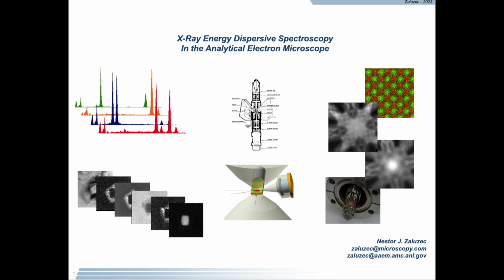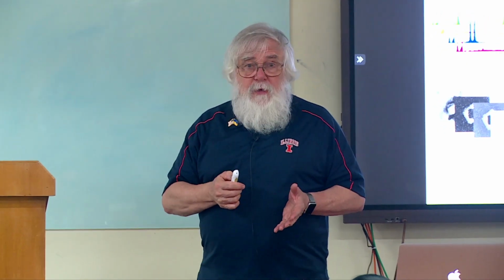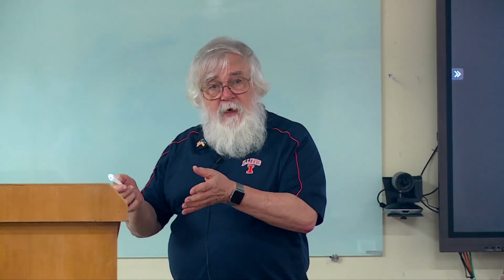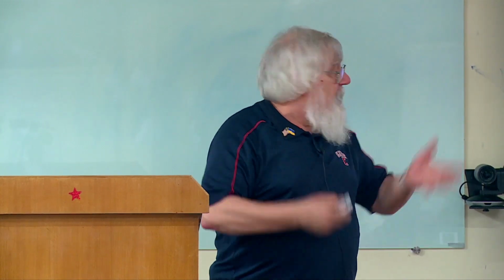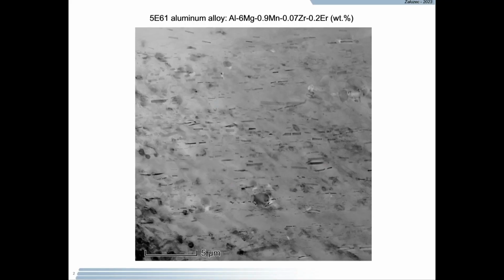So far, we've looked at the microscope as a tool for generating a beam, creating images, creating diffraction. That's a valuable bit of information. You saw some beautiful images of defects that Hamish was showing you today. Here's another nice image of defects in a material.